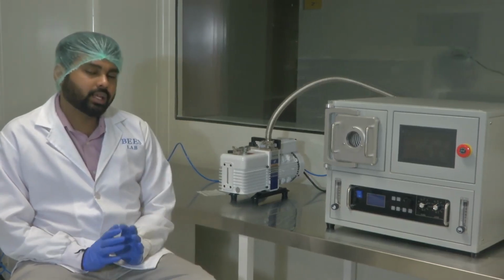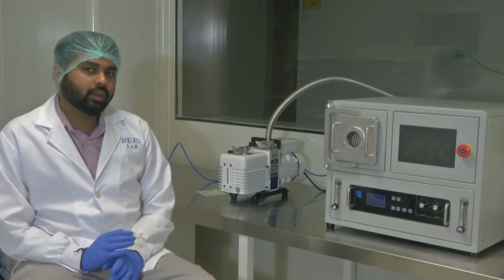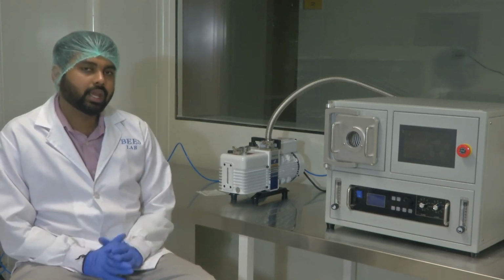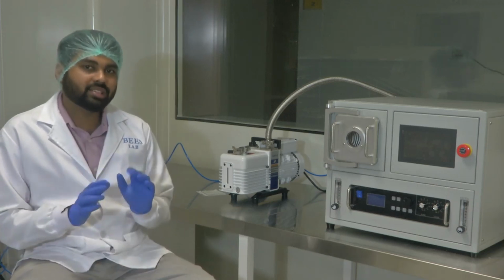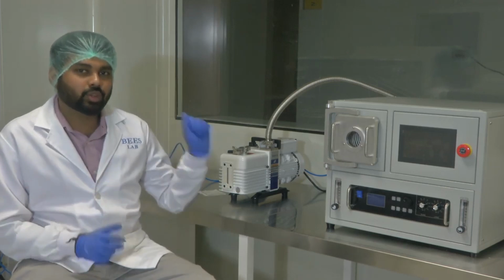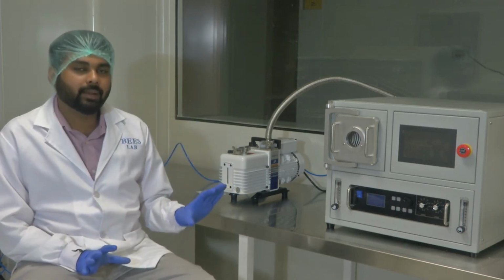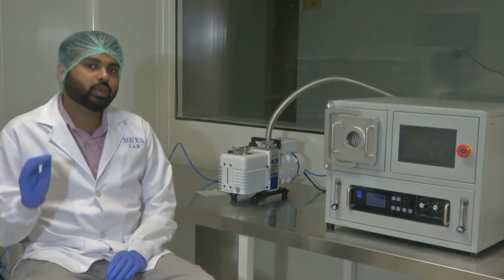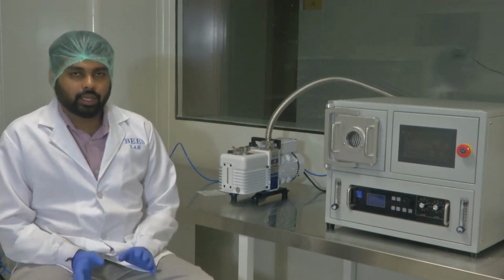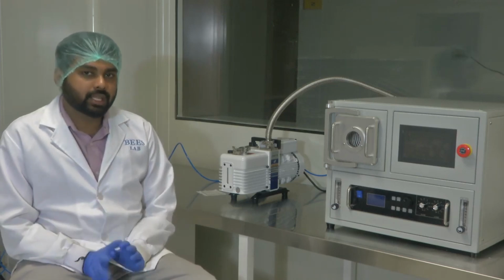So we saw that we have a chamber, we vacuum it, we fill oxygen inside it, then we apply RF power and plasma gets created. Before all this, you have to load your substrate inside, because before you close your chamber, you have to load your substrate. Then you do all these things. Then you keep it for a defined time, and the substrate gets cleaned, and then you take it out. This is the overall operation of the plasma chamber.